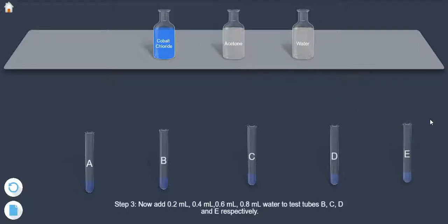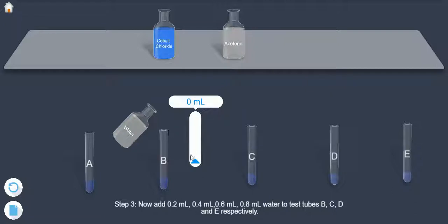Now add 0.2 ml, 0.4 ml, 0.6 ml, 0.8 ml to test tubes B, C, D and E respectively.